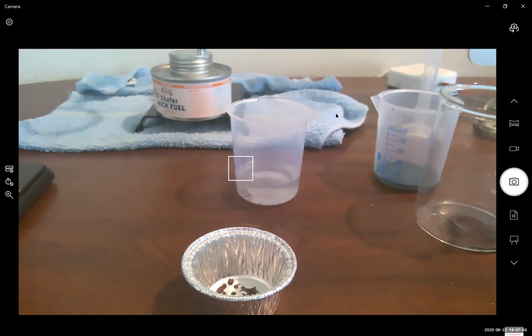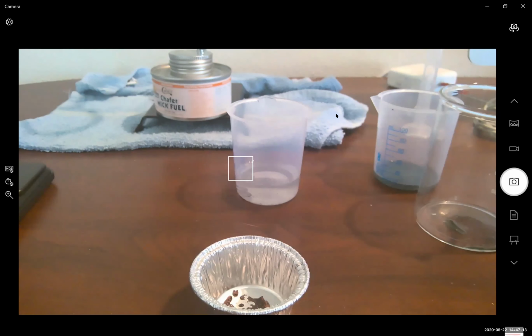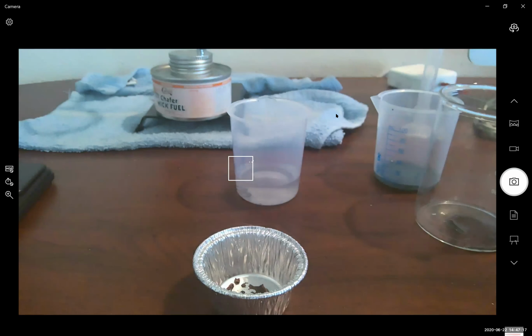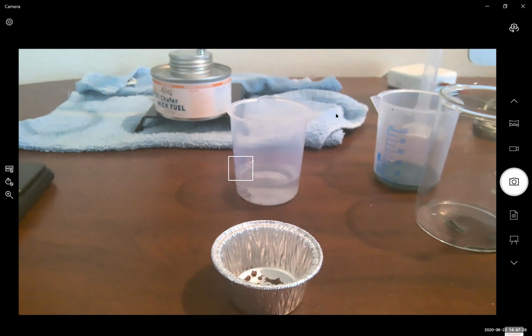Now, if you don't want to put your copper sample into the oven, an alternative is to allow this sample to air dry in a secure, well-ventilated area, such as where you're performing your experiments, for about 1 to 2 days until it's completely dry. I'll be showcasing the oven method.